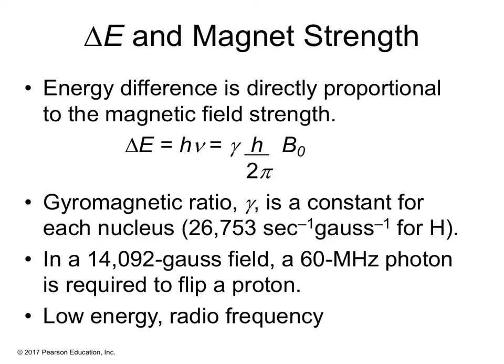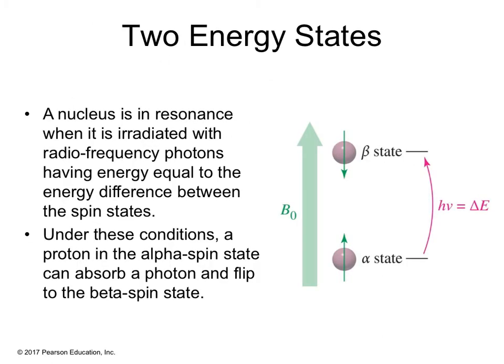And so there is some math, but we don't have to learn the math. I just want you to be able to apply the spectra identification for the compounds. So if you did want to go on to higher level NMR, you might need to study the math associated. So like I said, there's 2 different energy states. It's this energy difference that we're going to capture in the spectra.